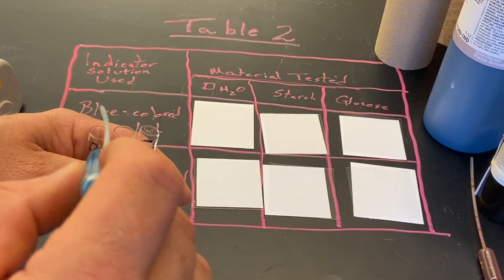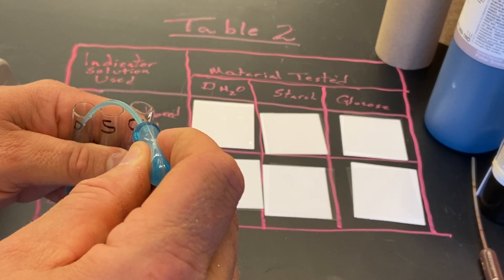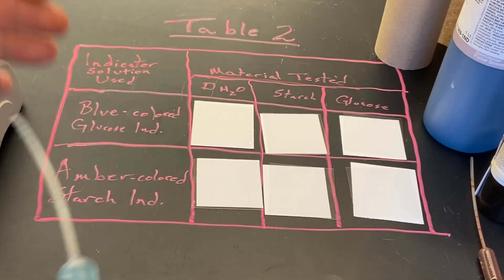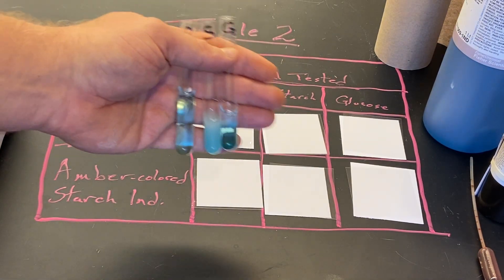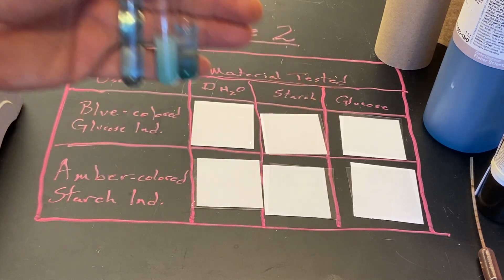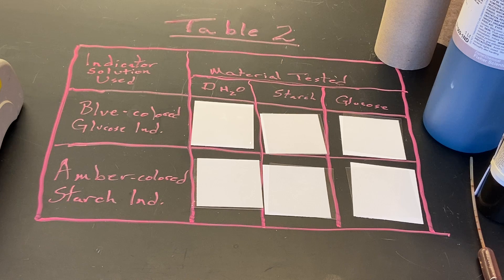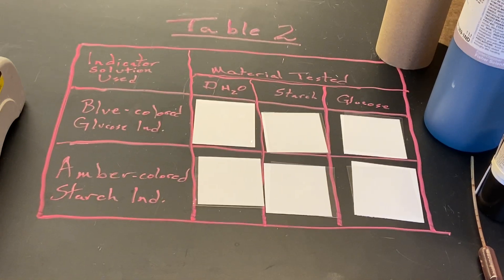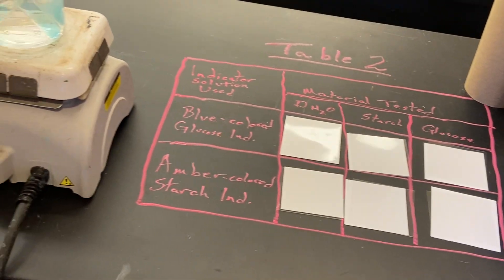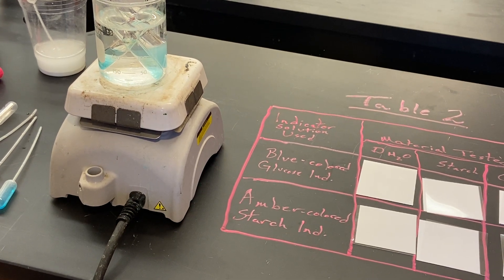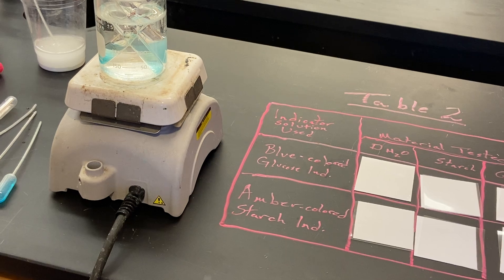You'll see they are light blue. Off to the side I have a hot plate with a beaker, so we're going to put those in there for just a few minutes and let them warm up. We've got a water bath set up and we're going to let those go for about four or five minutes, maybe a little less. If there's glucose present, you'll see an orange or brick red color.